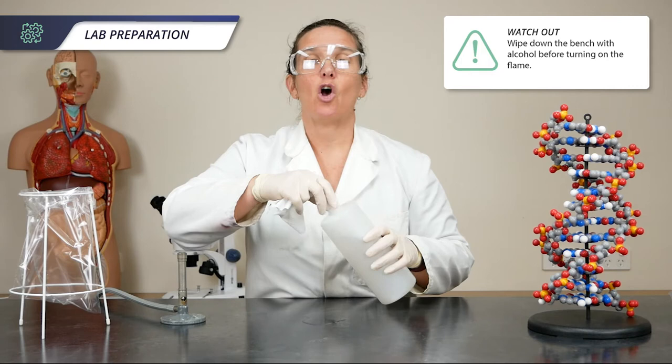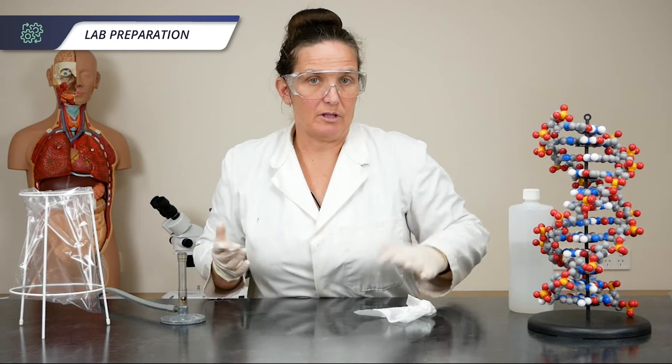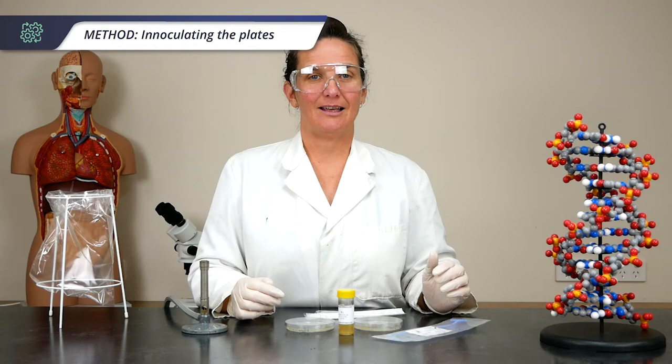Make sure the students wipe down their benches with the alcohol before putting on the Bunsen burner, because obviously alcohol is flammable. You may prefer to use a spray bottle for the alcohol — it makes it a bit easier.